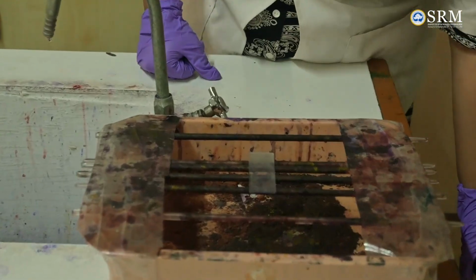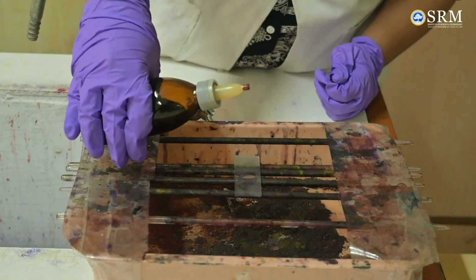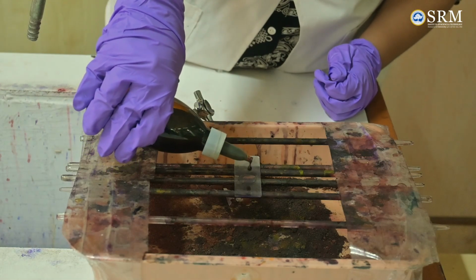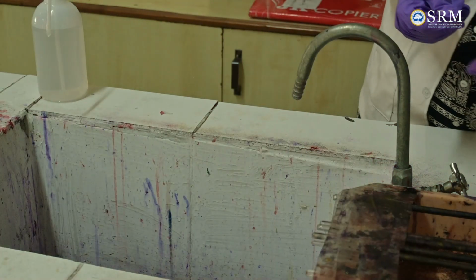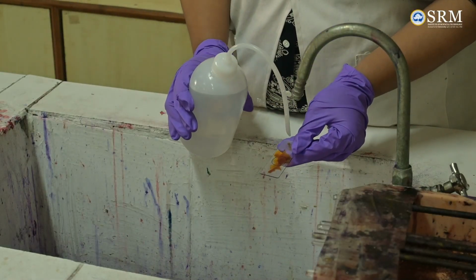Next we move forward to our second stain, which is the iodine stain. The iodine will form a complex with the crystal violet called CV1 complex. We leave the iodine solution undisturbed for 1 minute. So now our 1 minute is over and we wash the slide with distilled water.